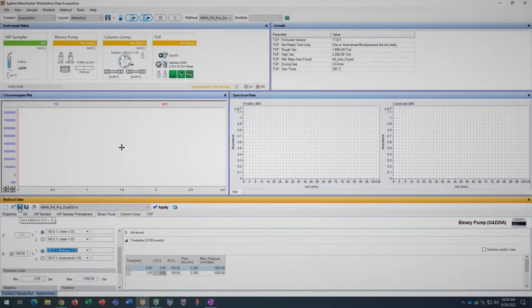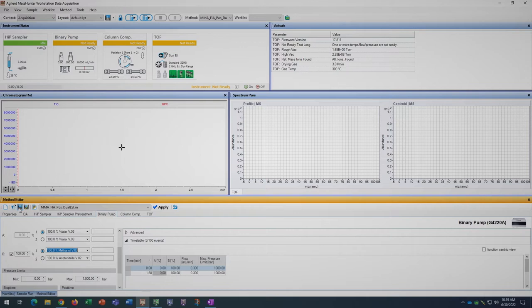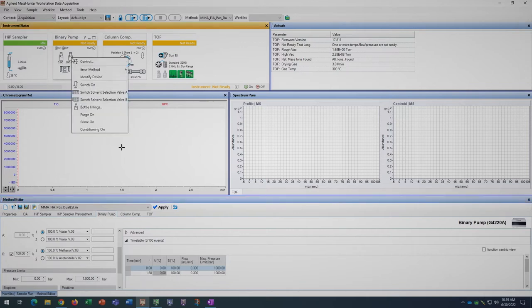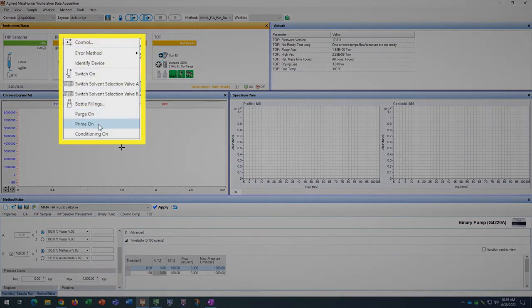If you have swapped the actual solvent bottle out for a different solvent, now is a good time to prime the solvent channel by right-clicking on the appropriate bottle and selecting prime on from the menu. This function takes a few minutes but will finish automatically.